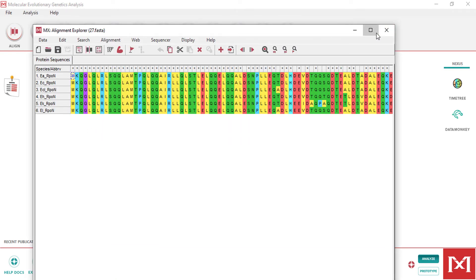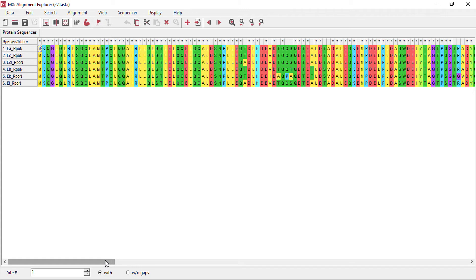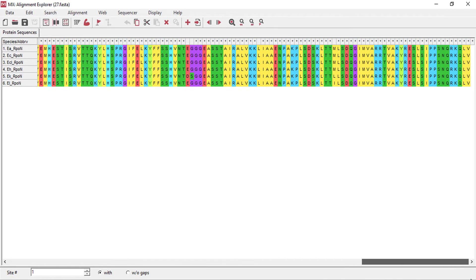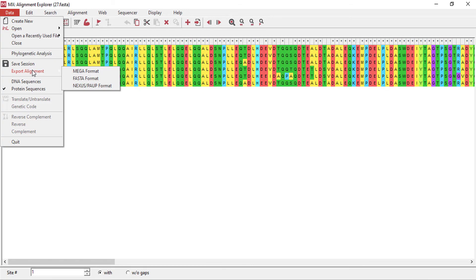In case of gene or DNA, as the nucleotide sequences are thousands of base pairs long, it will take much longer time to align gene sequences as compared to proteins. This is the aligned file of all the proteins I had.